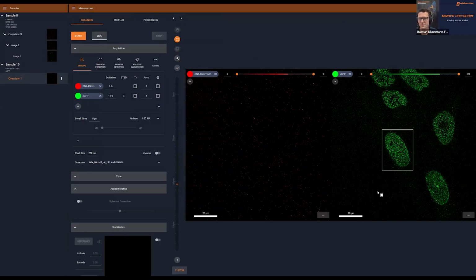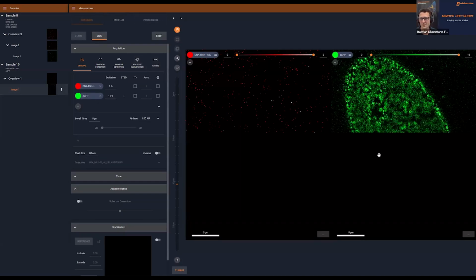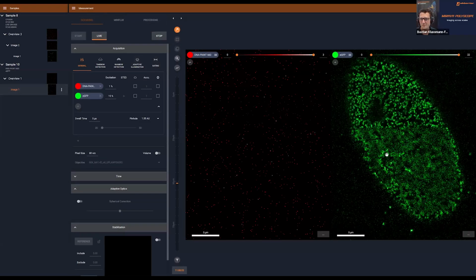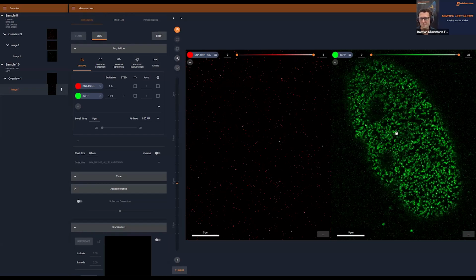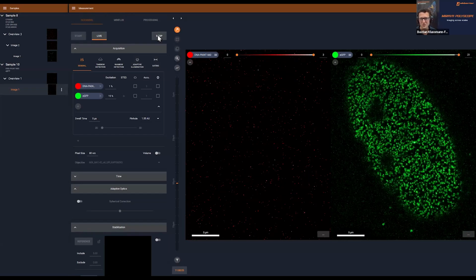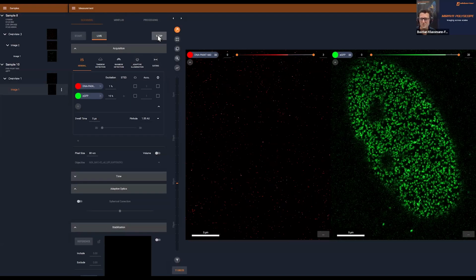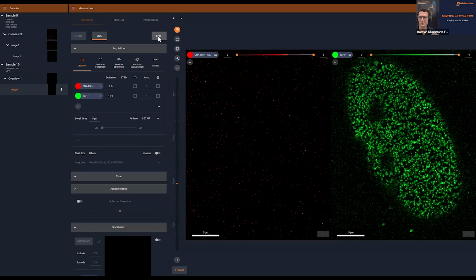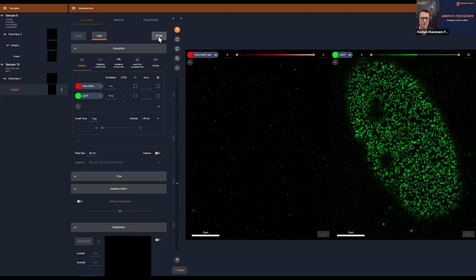We can just define a smaller region of interest here, in this case, the full nucleus, can again focus a bit. And then, from our bigger MINFLUX machine, we have adapted our stabilization unit, of course, also for the MIRAVA. Because we are working in the single-digit nanometer resolution range, you want to have your sample as stable as possible.